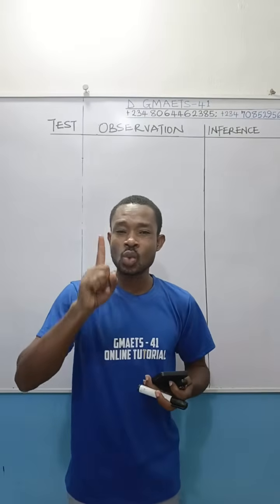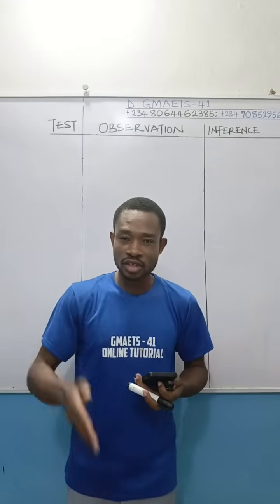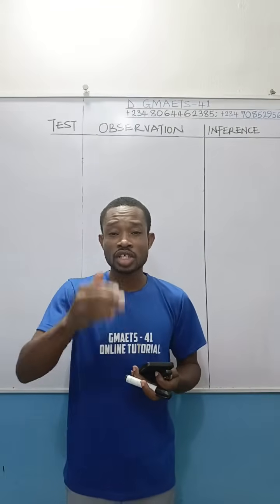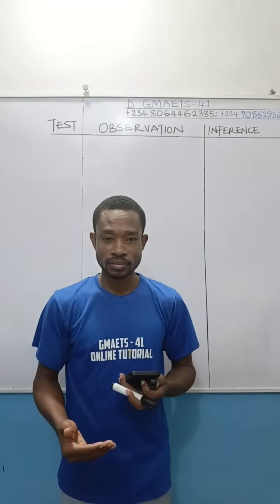Please, I repeat, 1, get to know the reagents you use to carry out the test. Then 2, get to know the color changes in the process.